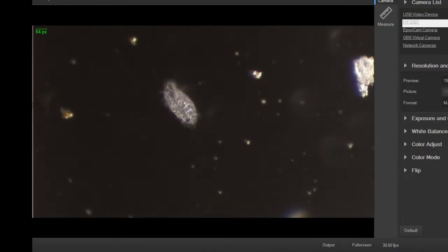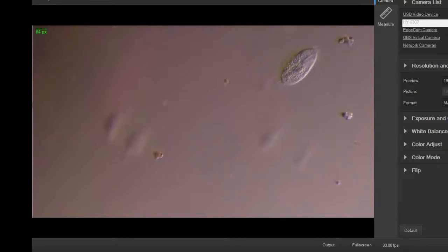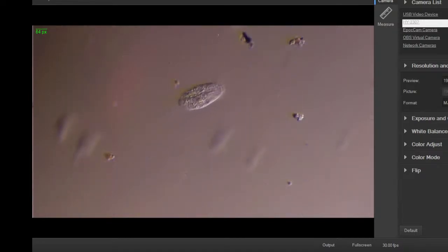Let me try a little bit of oblique lighting. This is fun because you get a 3D effect. I can get this set just right here. There we go. A little more 3D looking. Bring out some of the details, not just the inside of the cell, but the outside of the cell. You see a groove there going down. Almost makes it look like a coffee bean. Where'd he go? Oh, there we go. It's way over there.